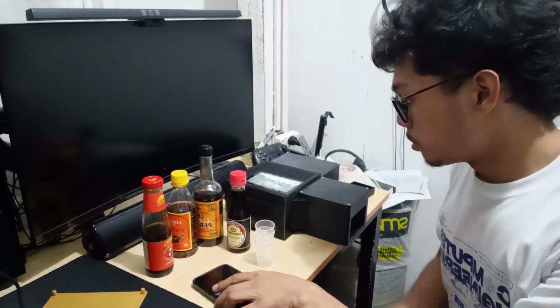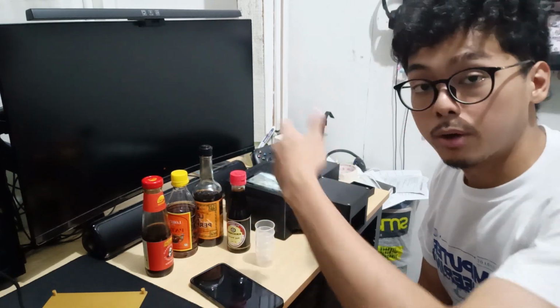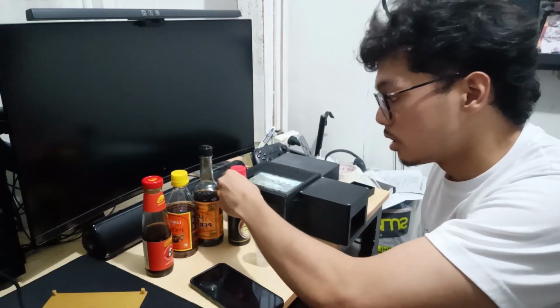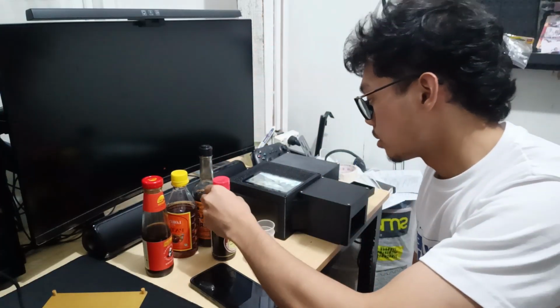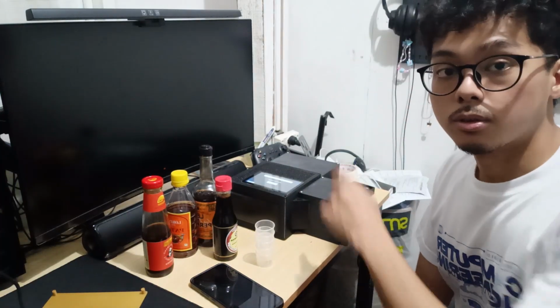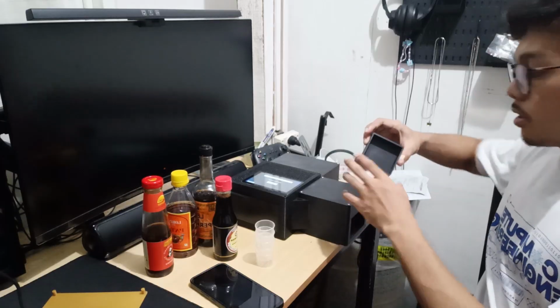So now I'm going to actually test all of the samples, so one by one. So I'm going to use the soy sauce first. So I open the app, and I'm going to close.